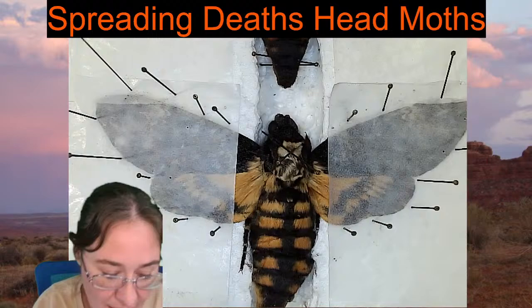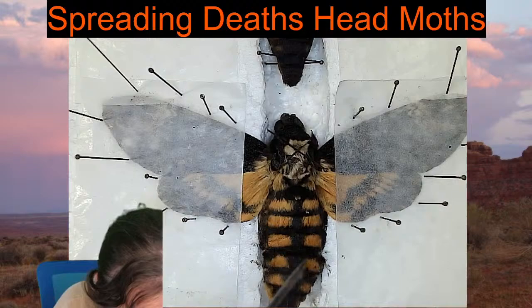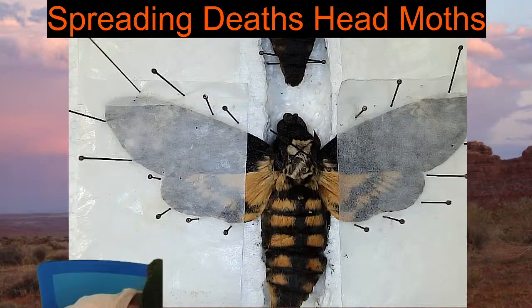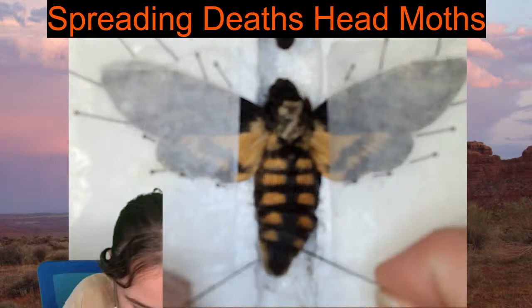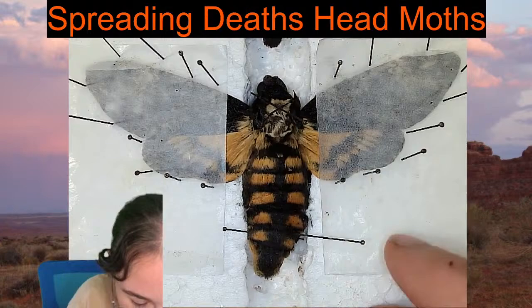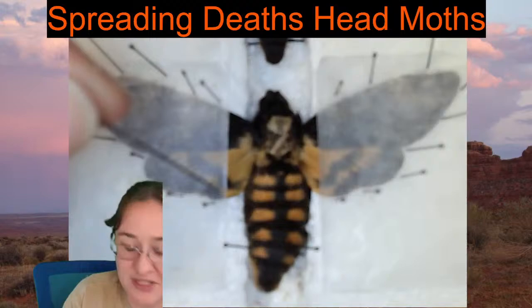So this is my dissecting probe. There. It needed to kind of get tucked underneath the abdomen. All right. So we've got that, and now I'm going to see if I can get this abdomen to curve straight. Nope, it's not going to curve straight. So instead, I will cross underneath it. These moths do tend to, because their abdomens are so large, they tend to be pretty heavy, and they kind of sink down into the tray. So it's better after you've secured it around the sides to put the pins actually underneath the abdomens rather than on top. Then I'm going to come up here and pull up these antennae.